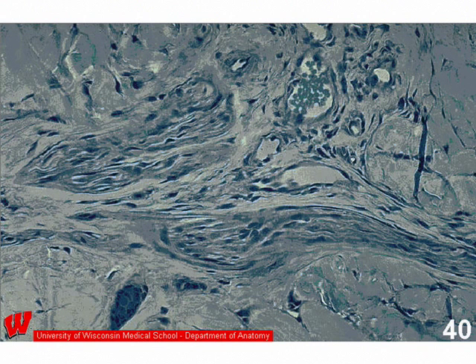As the axons go out into the periphery, they run in the connective tissue space, which we'll learn about in the connective tissue lab. Within the connective tissue space, you will find blood vessels. So what I'm circling right here is a larger blood vessel, probably a venule, that contains blood cells, which happen to stain blue because of the staining methodology used.